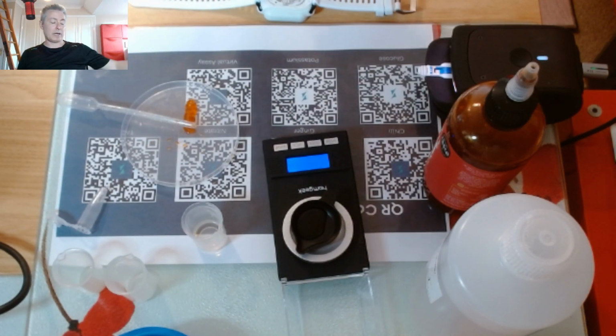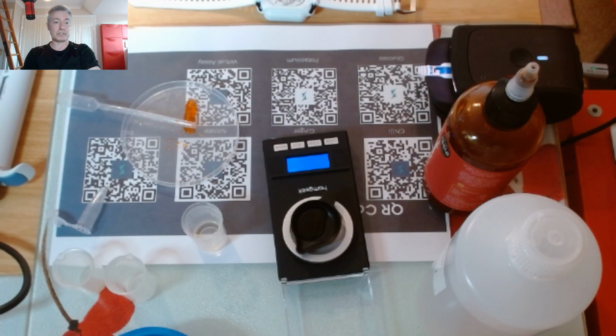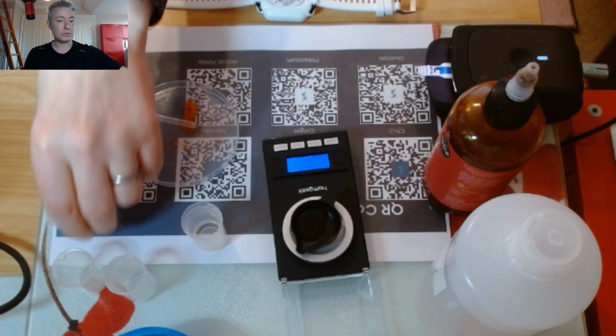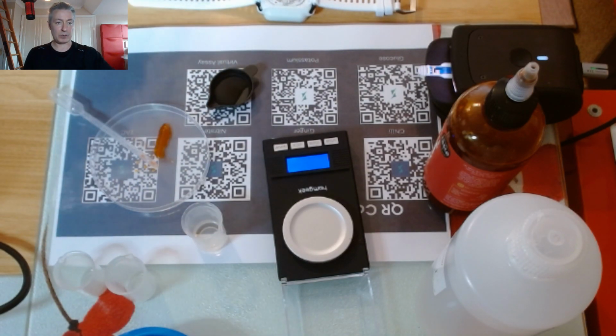Okay, not too bad. I got it at 1.02 grams. So you can appreciate that 9 parts of aqueous buffer, essentially 0.9 mLs of that, plus approximately 0.1 grams of the sample should bring me to about 1 gram, which I wasn't that far off, and I've done essentially a 1 in 10 dilution. What I'm going to do now is mix it in the pan. I don't want to lose any of this material because it will just give me errors, and I don't want them. And I'm going to put it into this little vial.